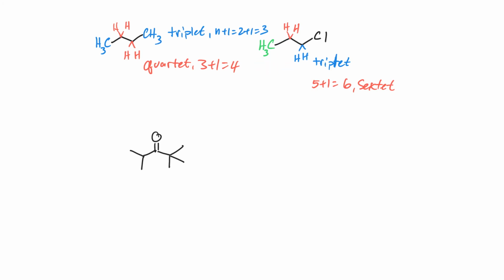It doesn't matter really that these hydrogens are not equivalent to each other. They will still add together to give us 6 lines in the signal for the red CH2. Sometimes this 6-line signal gets a little complicated, but right now let's just understand that there are 5 nearest neighbors, so we should get a 6-line signal for the red hydrogens. And then of course for the methyl, it is next to simply only the red hydrogens. That would be another triplet in this case. So the green hydrogens are a triplet. It is very common to see a 3-hydrogen triplet in the methyl region of molecules.